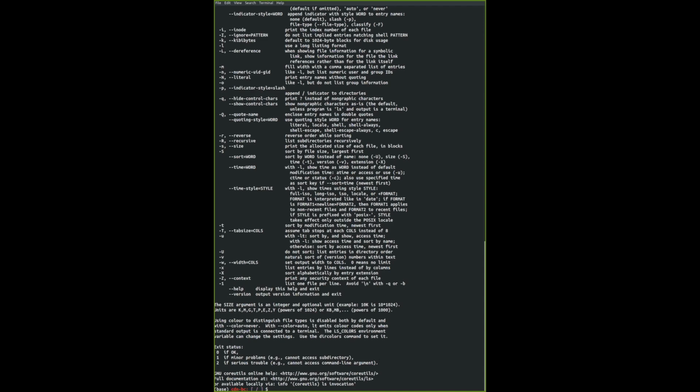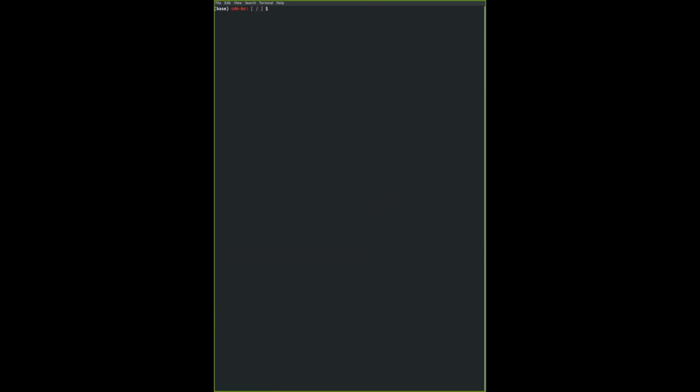So maybe I'll tell you exactly how to clear the screen. If your screen is cluttered and you want to clear whatever is on top, the function is called clear. Now you see my screen has been cleared. You can type this on your own computer as well. I'm going to type this again for those who can't see the previous function. Since it's so far down, clear will clear everything on your screen. It will not clear the history, don't worry. Your history is still safe. It just clears the view of your terminal at the current moment.